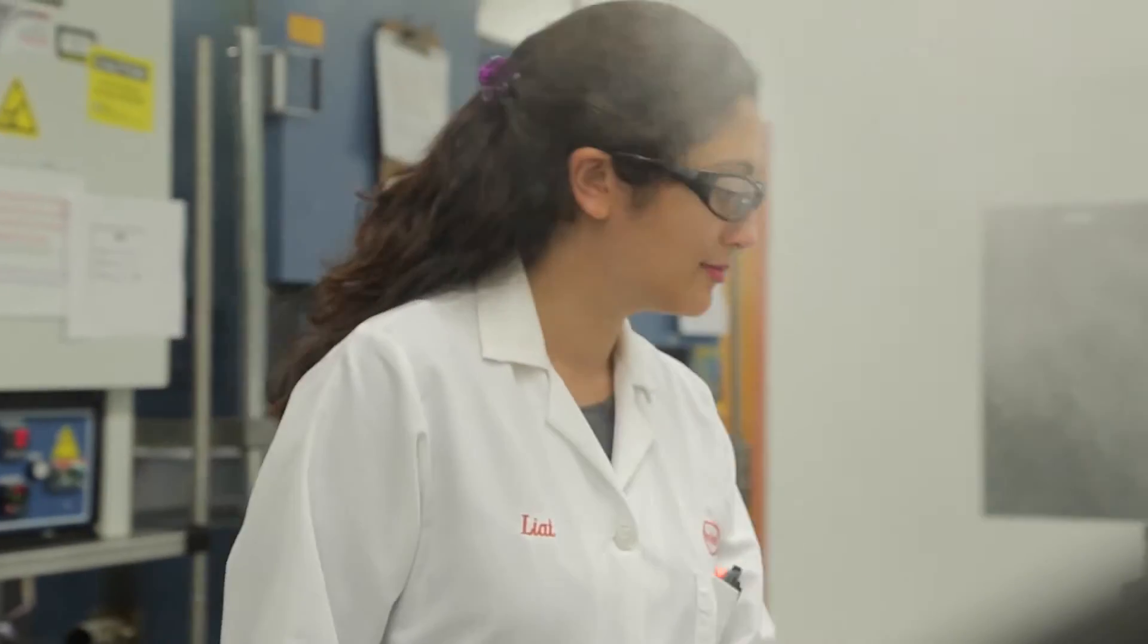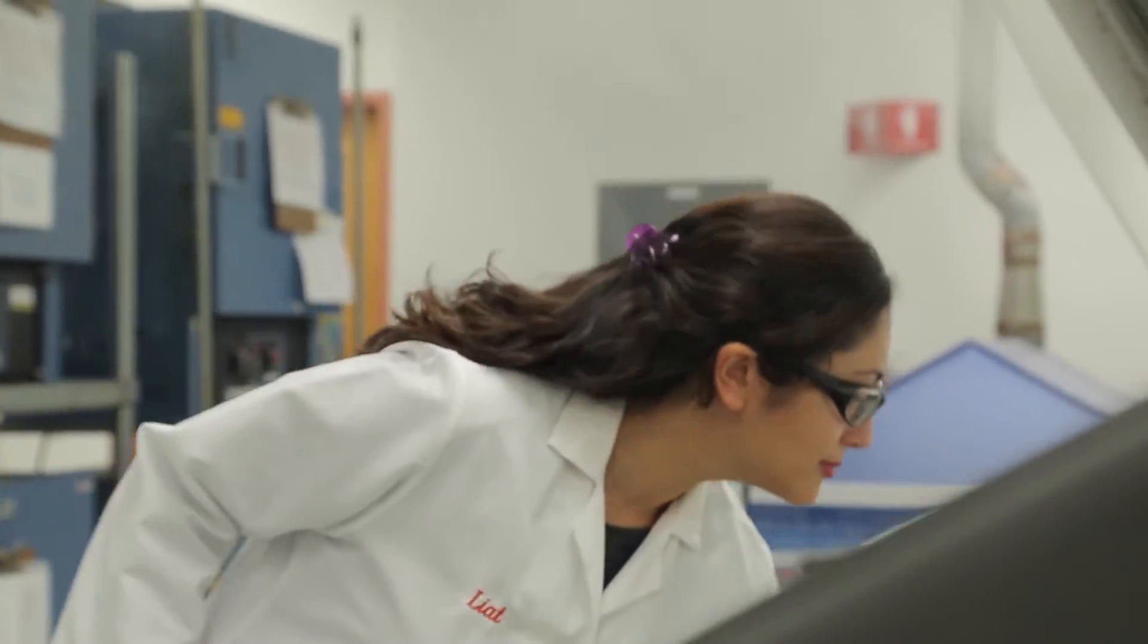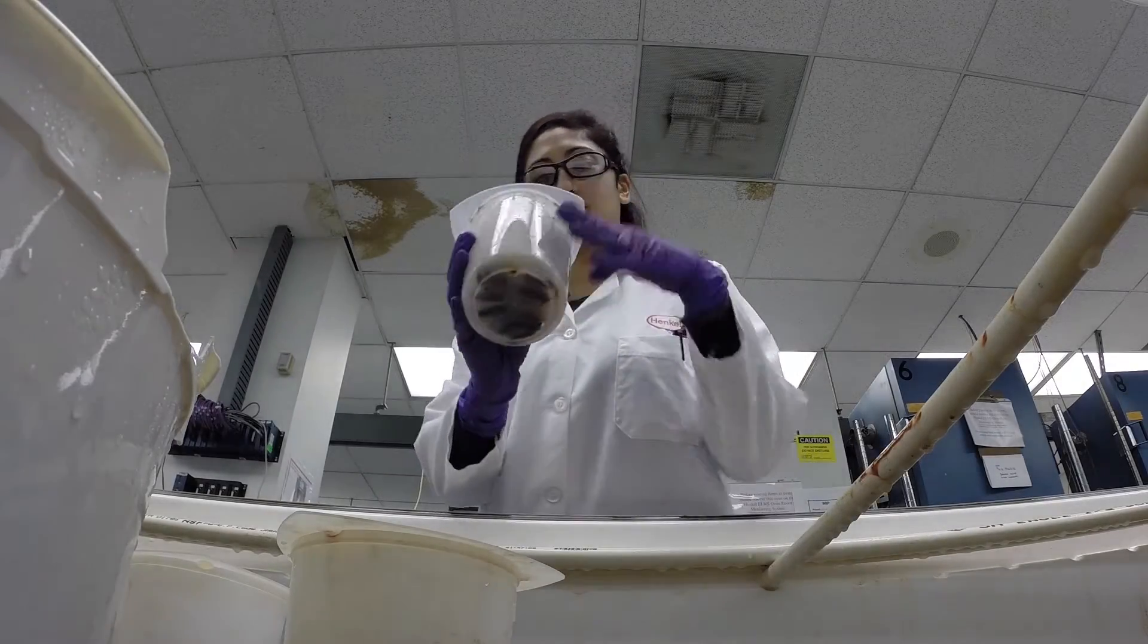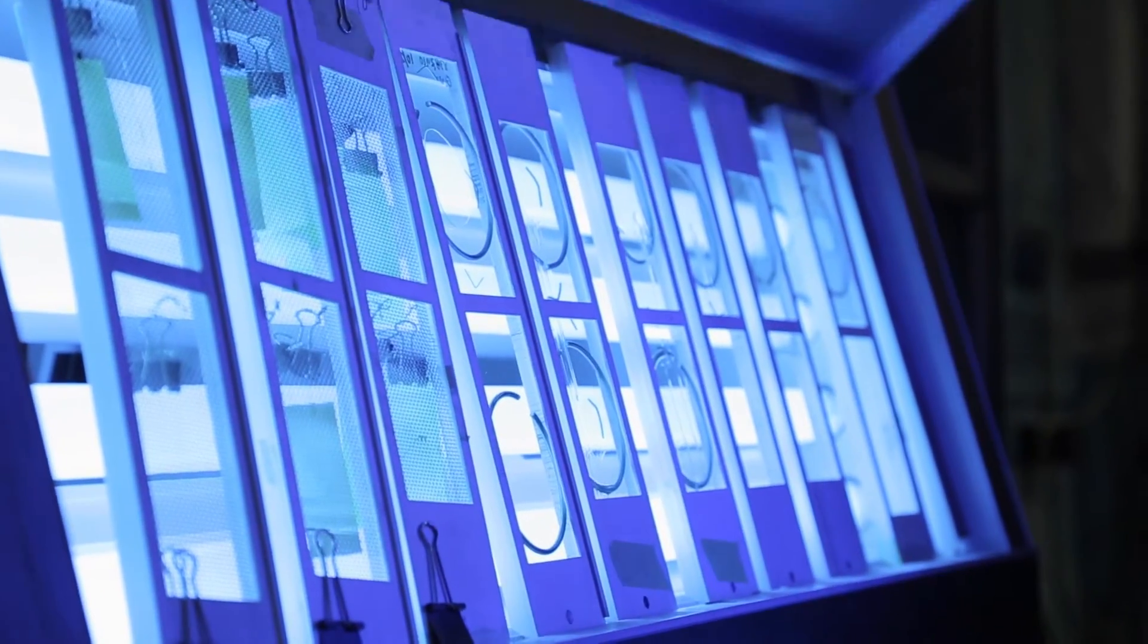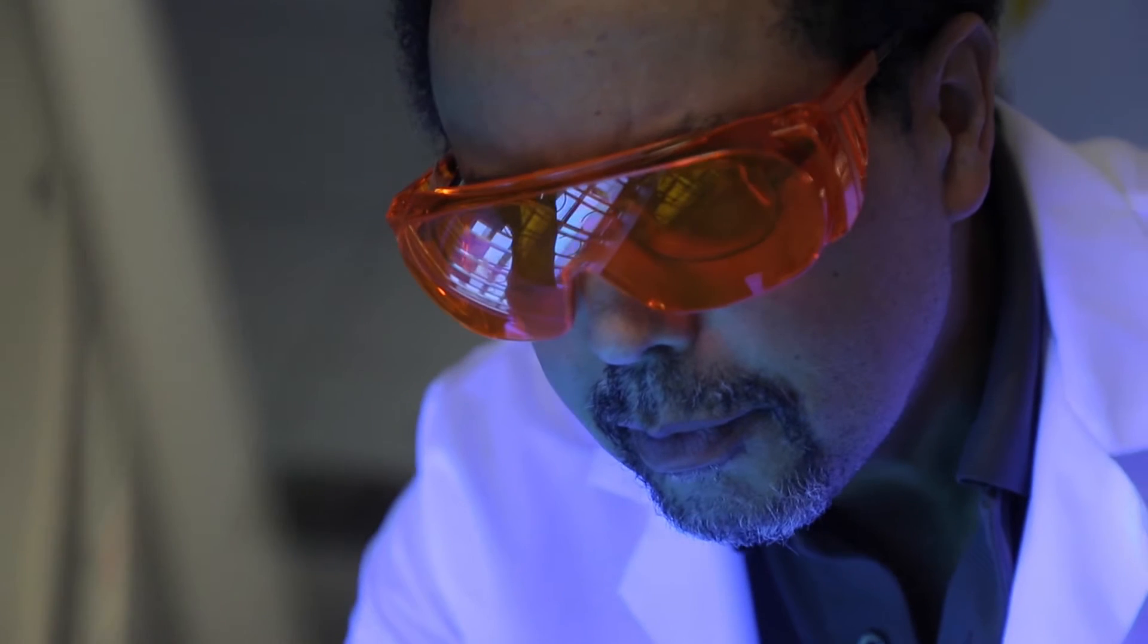Longevity studies and endurance tests are crucial for determining adhesive choice and product shelf life. Packaged adhesives, bonded or cured parts are placed in environmental chambers or immersed in chemical solutions for a specified time period, after which their performance is evaluated.